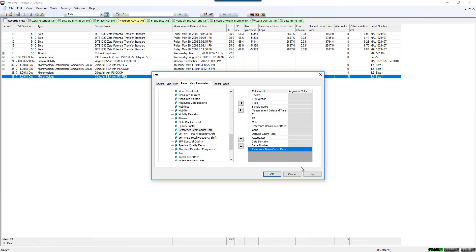Basically for zeta potential, part of the beam goes through your sample and is looking at the scattering from your sample. But we also have a beam splitter that routes some of the beam around your sample. You can actually measure that reference beam count rate and track that over time with your instrument as a way of gauging the health of your instrument. Make sure everything's properly aligned in the system. Make sure that your laser intensity is up nice and high. That will give you a good indication of the health of your instrument for a zeta potential measurement specifically.